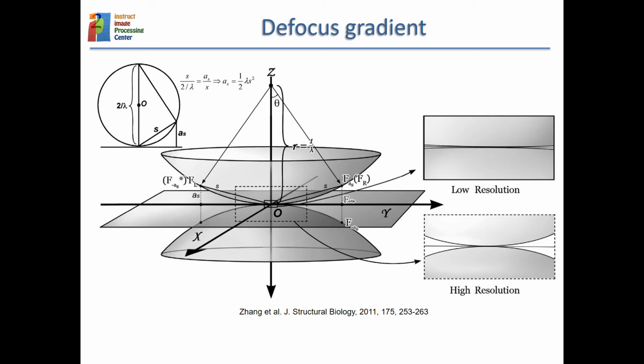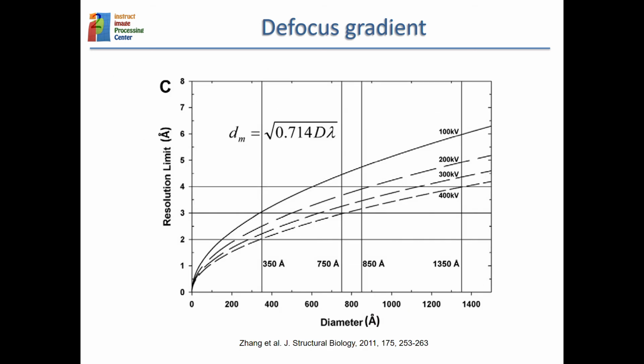So the point is that the projection that you have in the microscope is not a plane of the 3D Fourier transform, but it is on the surface of some sphere, and then you have to place back correctly the 2D Fourier transform into the 3D Fourier space, not lying on a plane, but lying on this sphere.